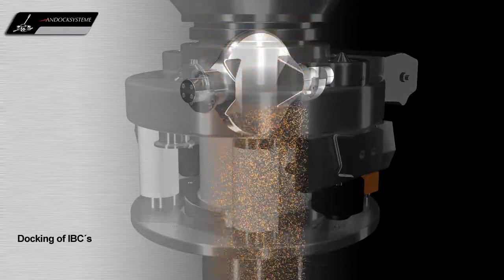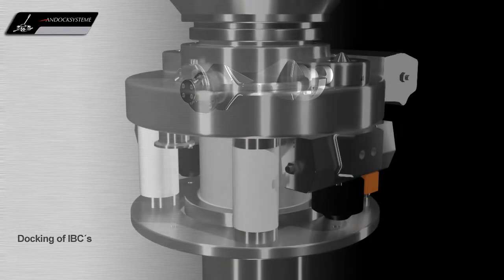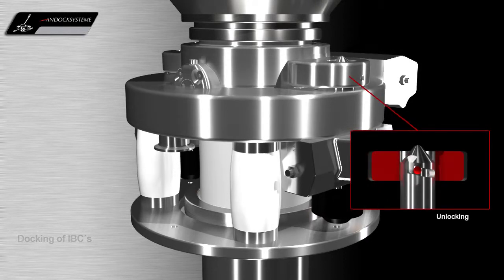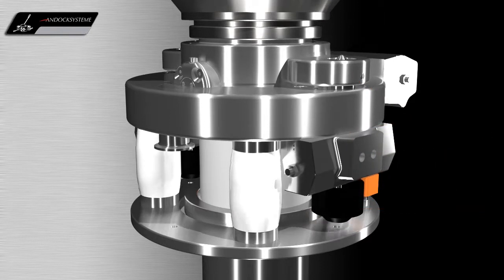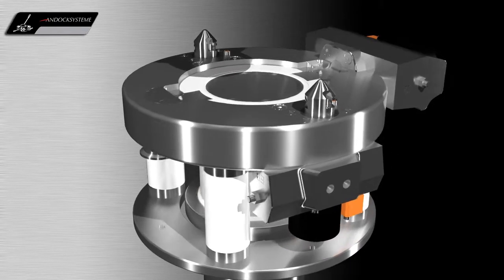When the container is empty, the valve closes both halves of the system and the docking system can be unlocked again. The container with the passive valve is then removed by means of a post-hoist.